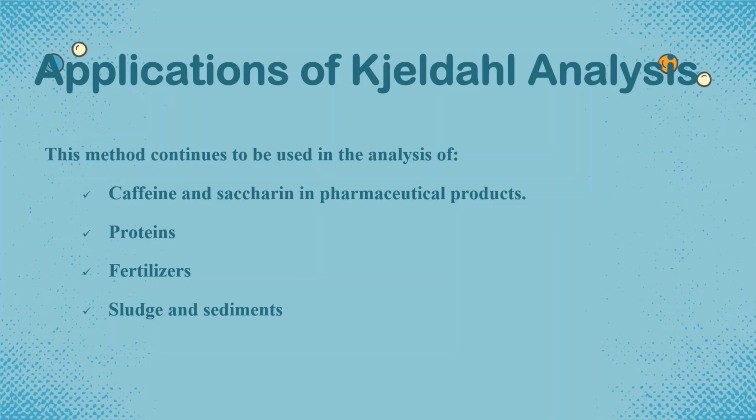Applications of Kjeldahl analysis. This method can be used for determination of nitrogen in caffeine and saccharin in pharmaceutical products. It can also be used for determination of nitrogen in proteins, in fertilizers, and in sludge and sediments.